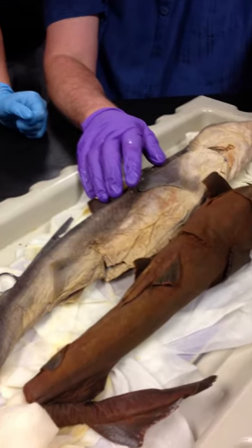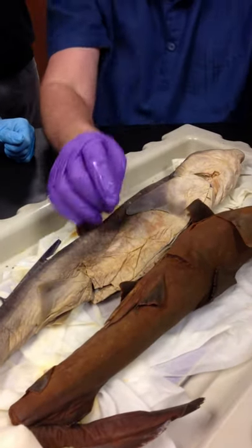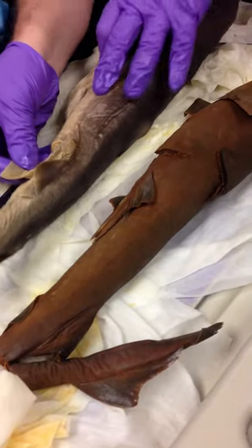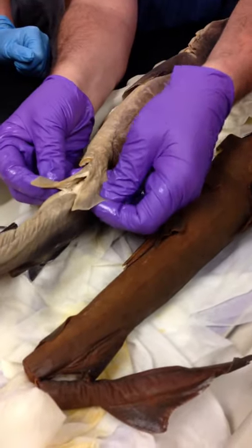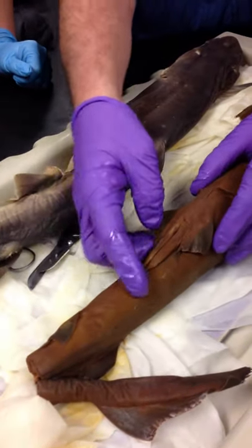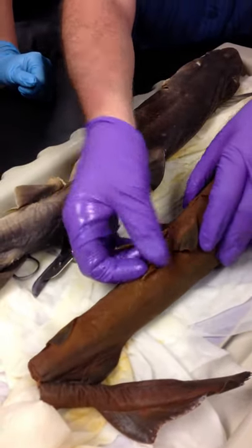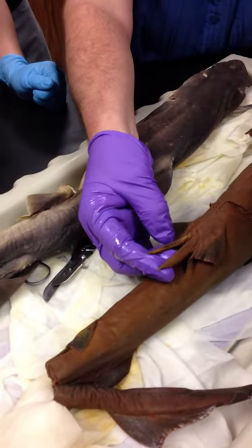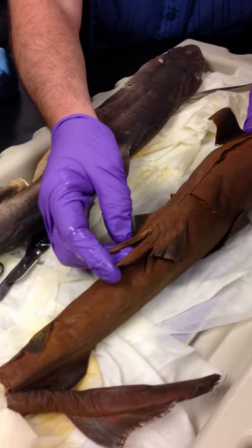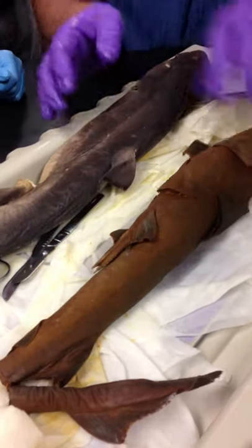How do I know it's a male just by looking at it like this? Well, I can see stuff. So this is a female right here, and you can see this is a pelvic fin. The pelvic fins have nothing on them. If I look at the boy, he's got pelvic fins too, but, oh man, what is that? It's analogous to the penis. They're called claspers. Why does he need two? What's he trying to compensate for?